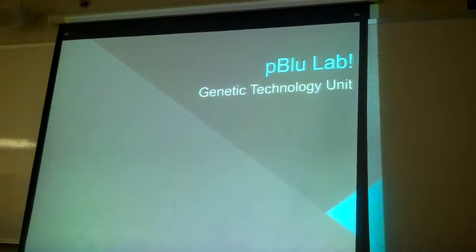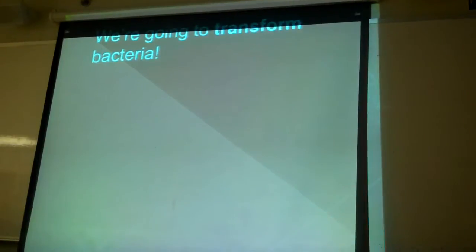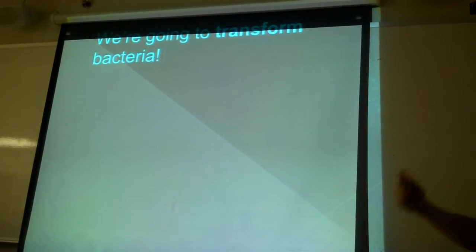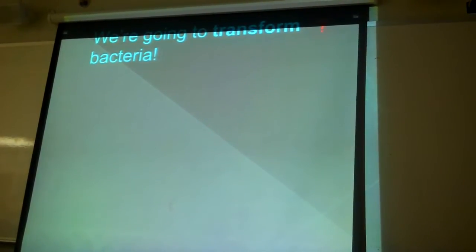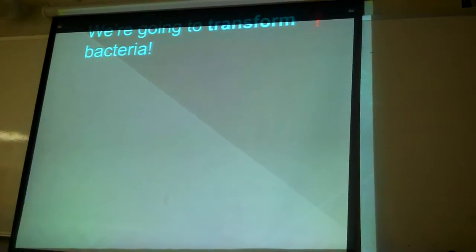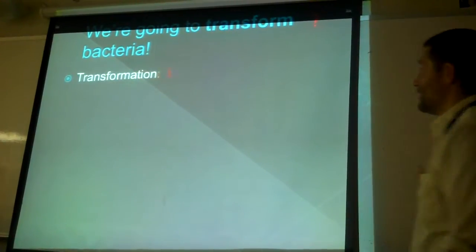So we've done a unit on genetic technology. We're going to do DNA transformation. Okay? We're going to transform bacteria. If you can't read what that says because I have it pulled down too far, I do it every day. Transformation, we know what that is, right? Anybody remember? It's where you add DNA to make a different thing. Yeah, specific to bacteria. Very good. Insulin.